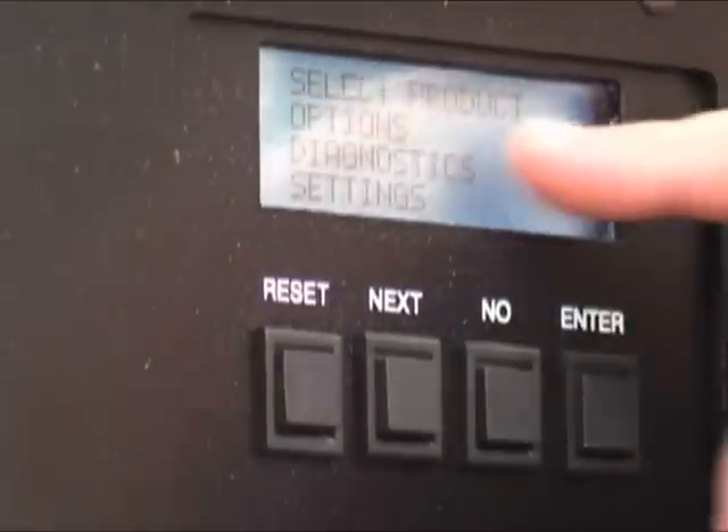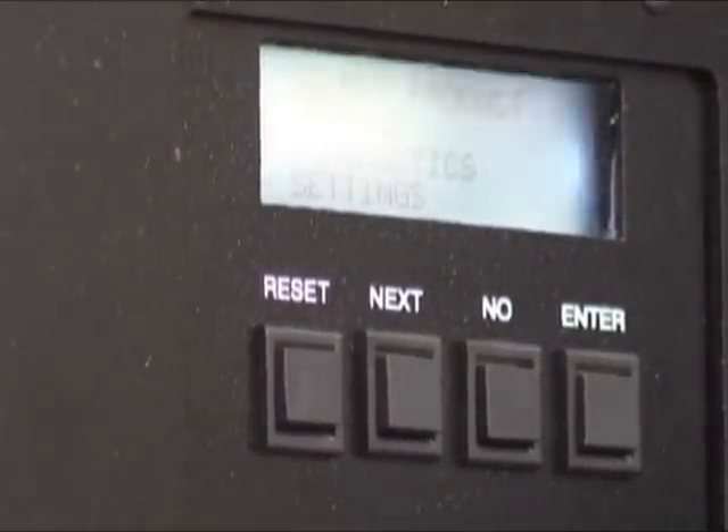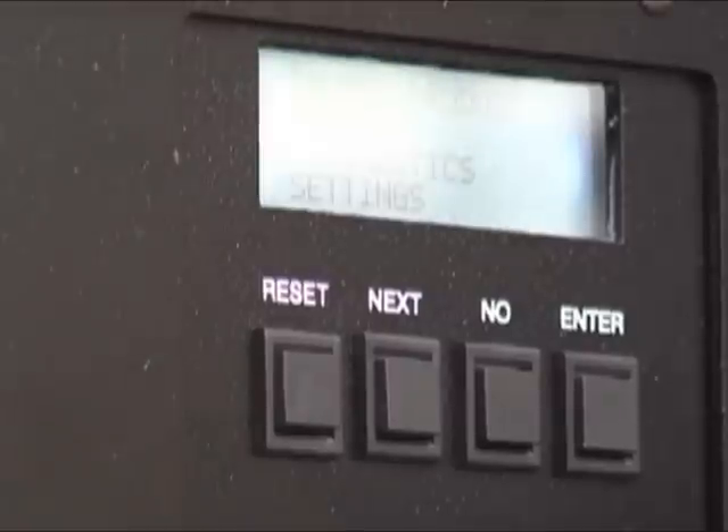Pressing no shows select product options, diagnostics, and settings. There are all these things in there, but you don't have to worry about them. Basically, all you need to be concerned about is to select a product.